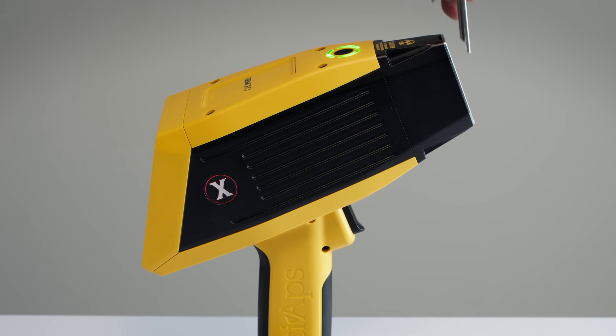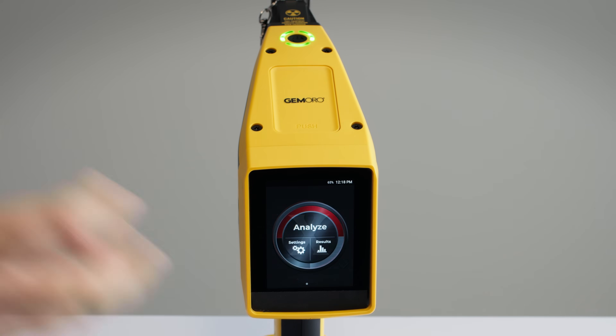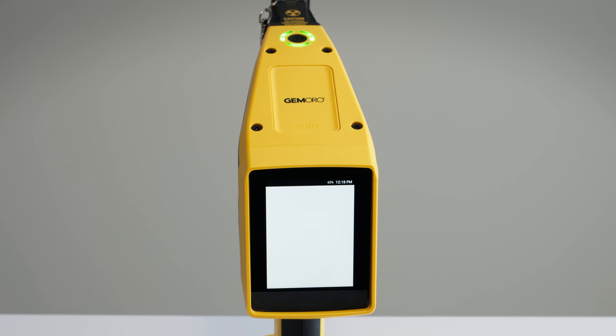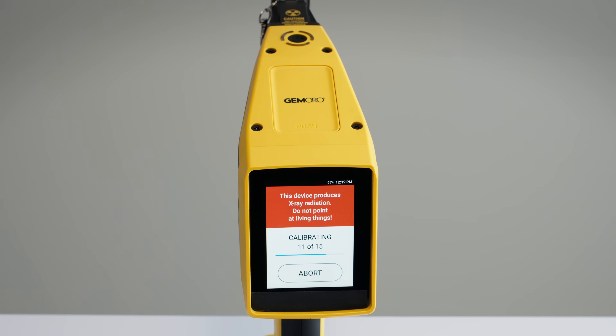Place the calibration plate on the front of the device and make sure it's secured. On the display, press Analyze and you will be prompted to calibrate. Wait for the calibration to complete before you take off the plate, and now we're ready.